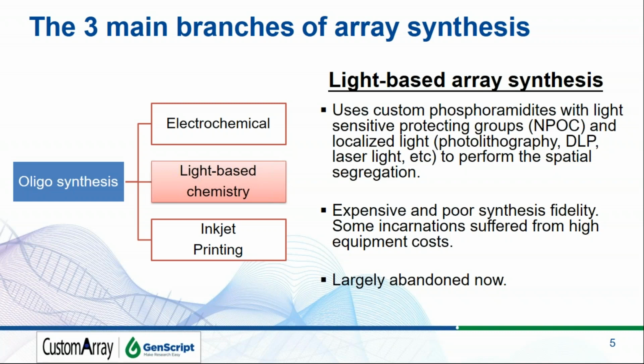It unfortunately suffered from being very expensive because of the custom phosphoramidites and also very poor synthesis fidelity. It was first, but it has actually kind of moved on from there. We don't really see this method being used much anymore.